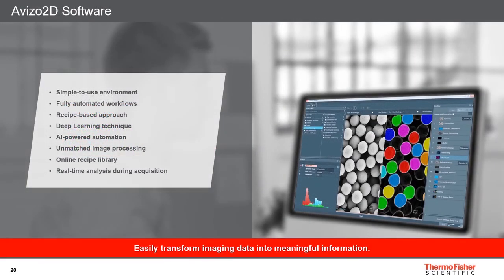This is new. Avizo2D Software is a simplified but powerful version of Avizo software designed with maximum ease of use in mind. Performing automated, reliable image analysis workflows, it allows users who are not image processing experts to seamlessly classify features and extract accurate quantitative information from 2D imaging data.